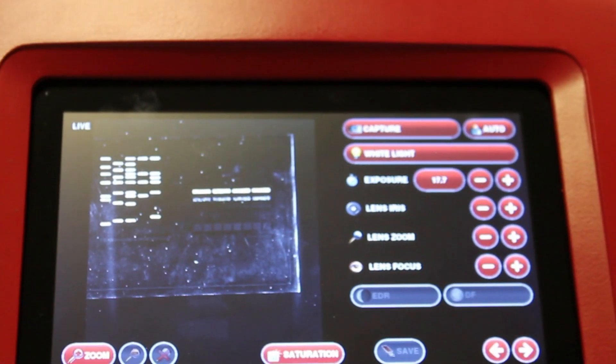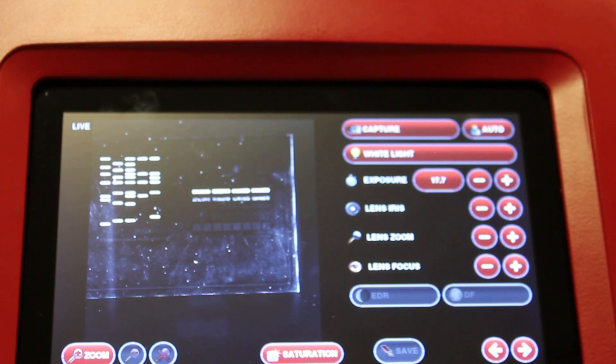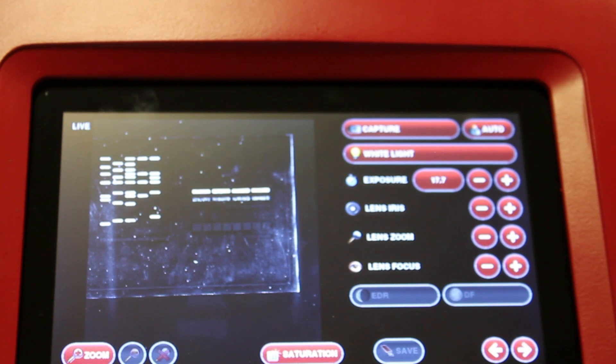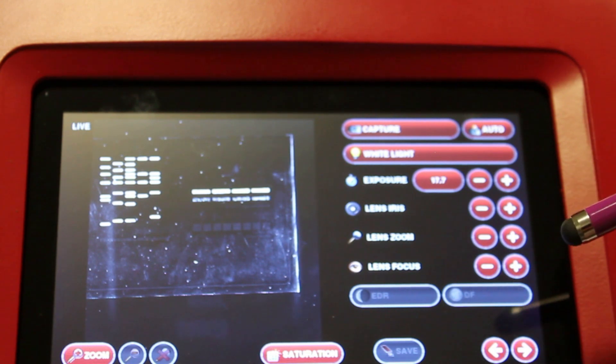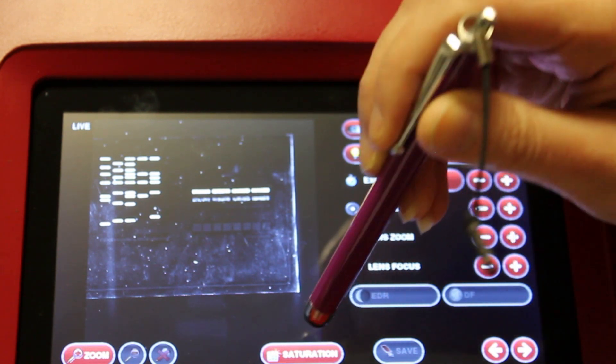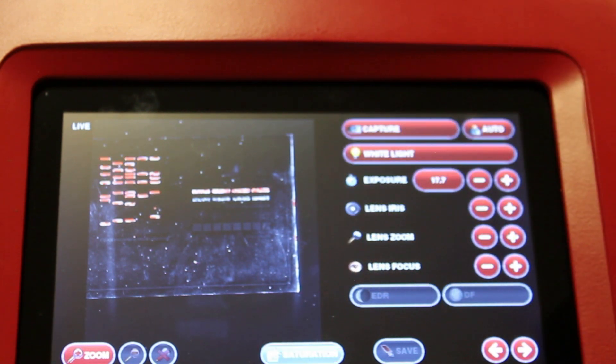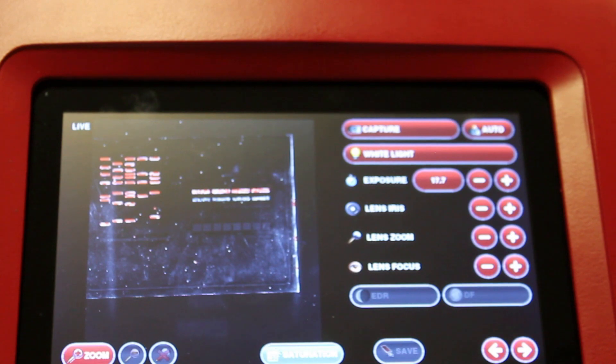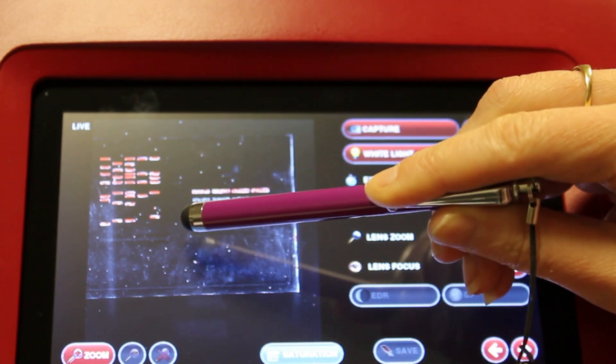When you have a live image, it's important to check that the image is not saturated, because when you've got a saturated image, you cannot quantify from that image. To check the saturation, you press the saturation button here, and any areas that are saturated will appear yellow, as shown here.